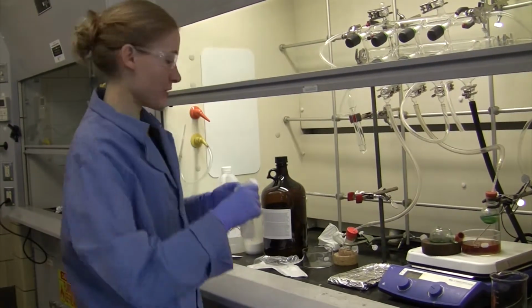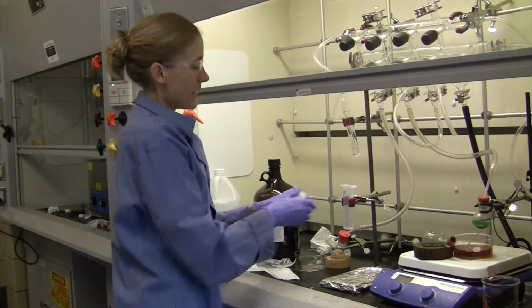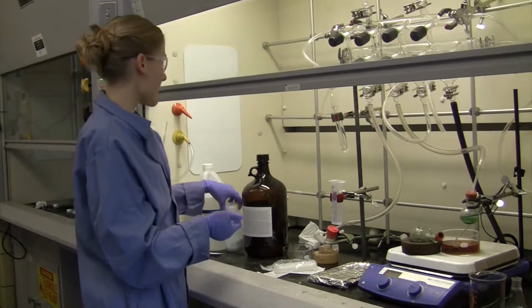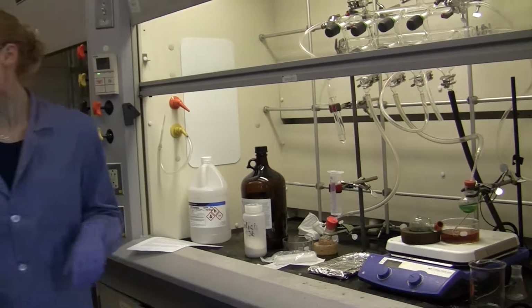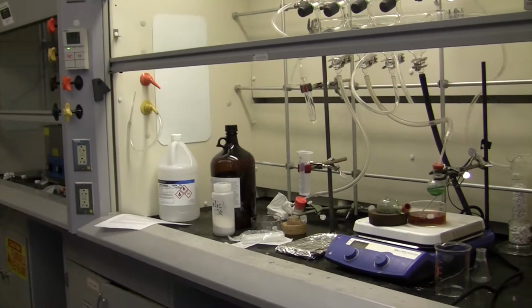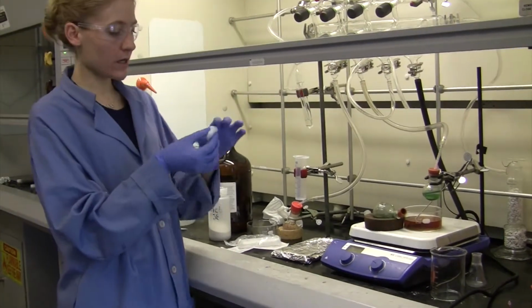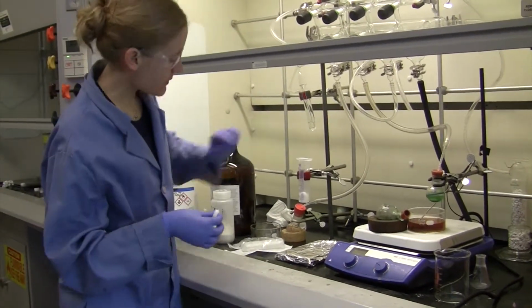Sometimes it can be a little bit tricky to take it out at the end. And then we want to block the bottom so that silica, which is a sand-like consistency, doesn't get out. So what we use for that is a cotton ball. You don't need the whole cotton ball, just a little piece of it. We're going to poke that down in there.